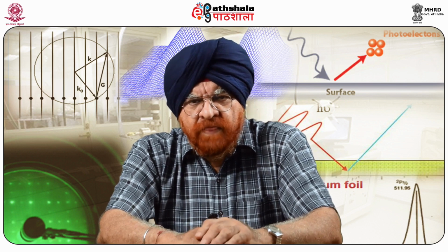So students, having learnt about CFM from different angles, in this module we have talked about the instrumentation part. When it comes to that, we have known that chemical force microscopy, abbreviated as CFM, is basically an extension of atomic force microscopy that employs a chemically functionalized tip, which makes it possible to control chemical interactions between tip and the sample.